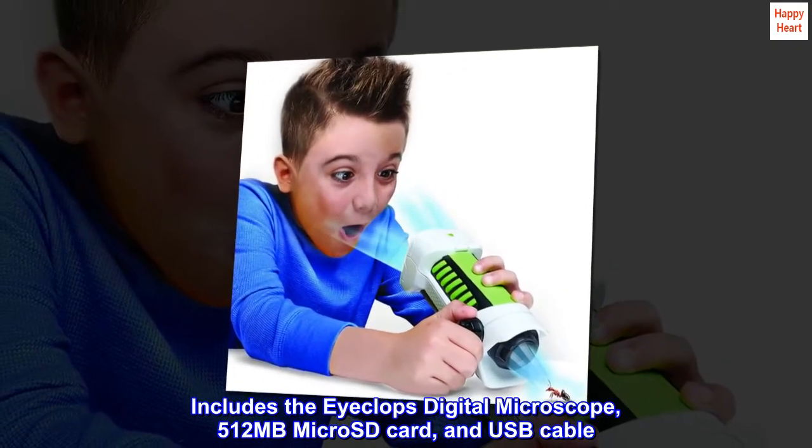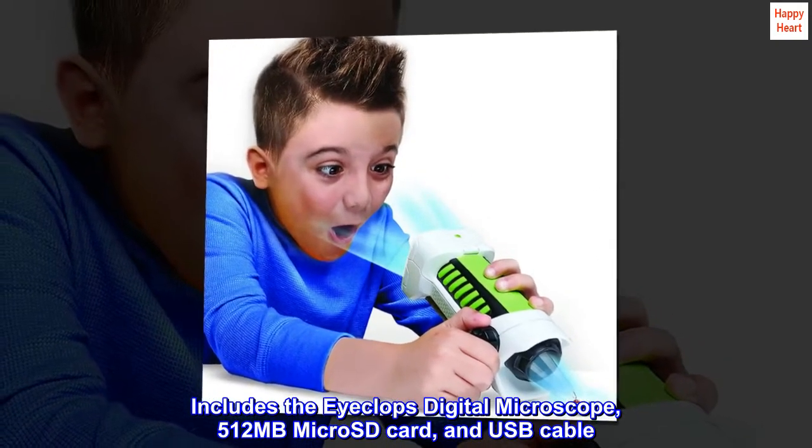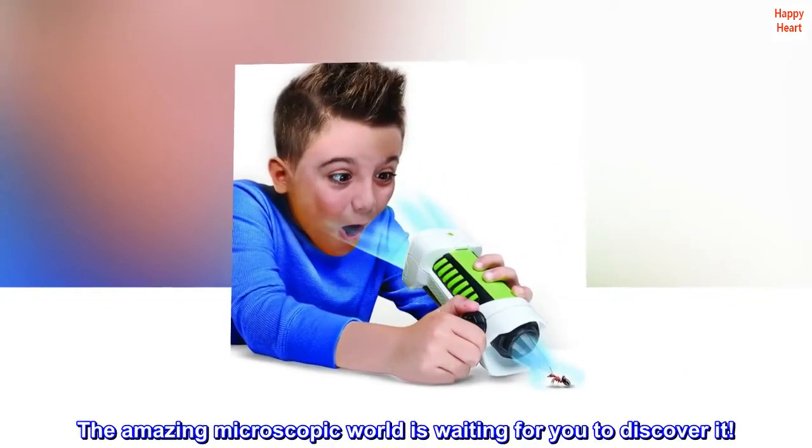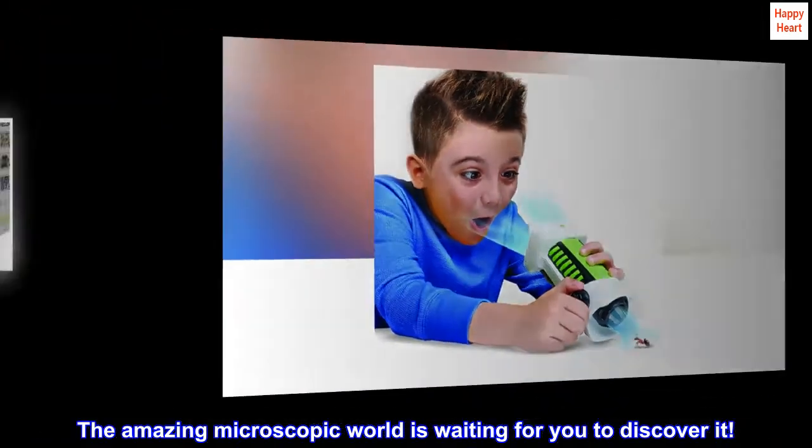Includes the Eyeclops digital microscope, 512 MB micro SD card, and USB cable. The amazing microscopic world is waiting for you to discover it.